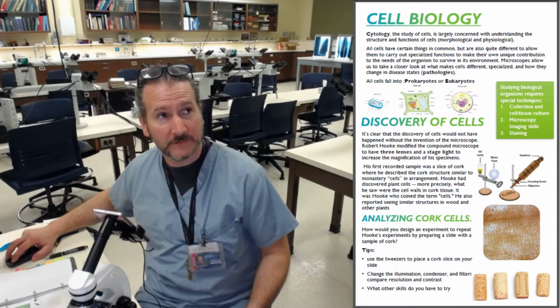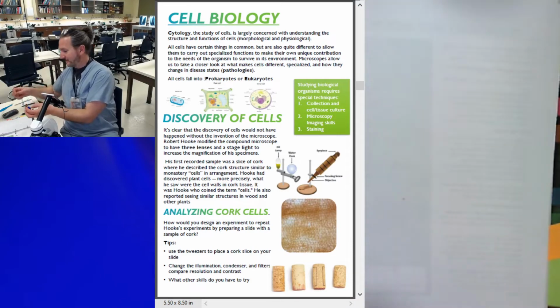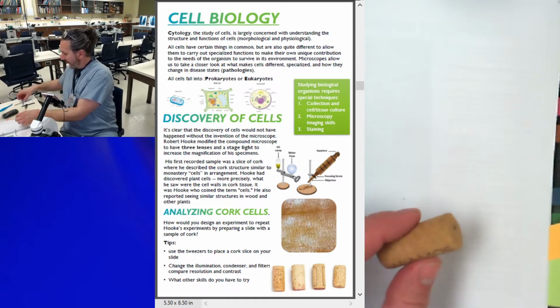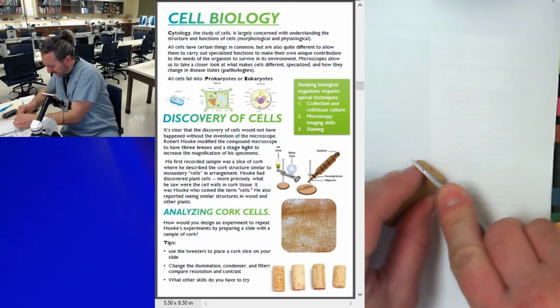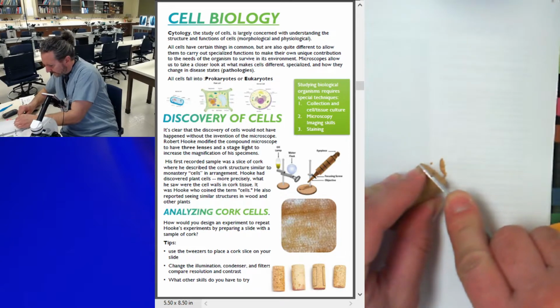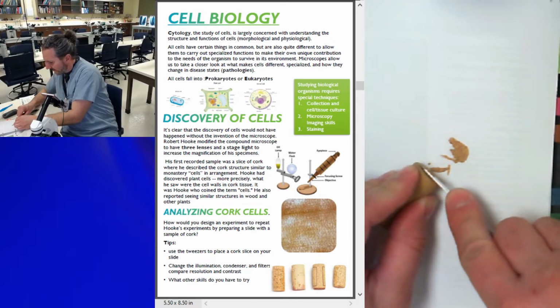we can do a little shaving on our own. Oops, that's what we want right here. That's better. It took me a couple tries. So I'm going to take this, and you can take a really sharp knife, like a scalpel, and shave really thin pieces off. They have to be very, very thin. And even with a really super sharp scalpel, sometimes that's not easy.